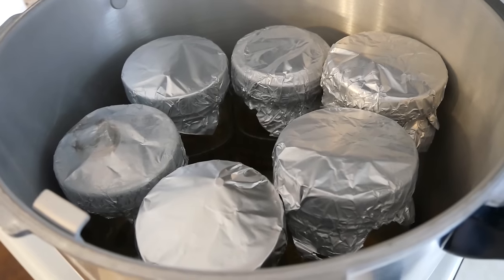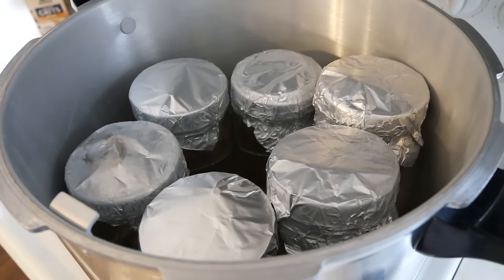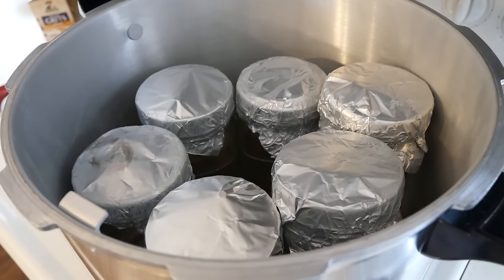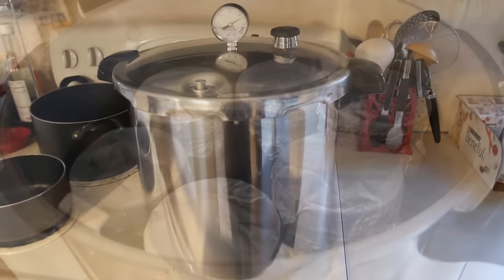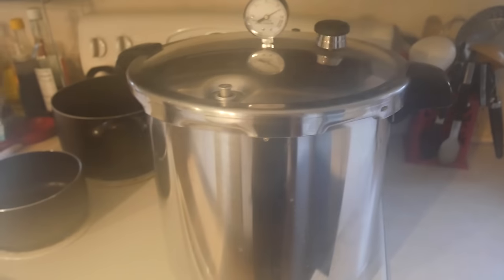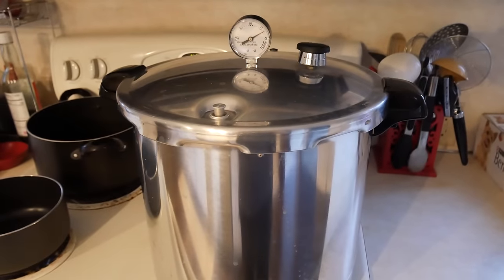Your jars will go into your pressure cooker and we're going to pressure cook this at 15 PSI for 30 minutes. After 30 minutes is up, go ahead and turn off your heat and let it depressurize on its own until it's cooled down to room temperature, then open them up.